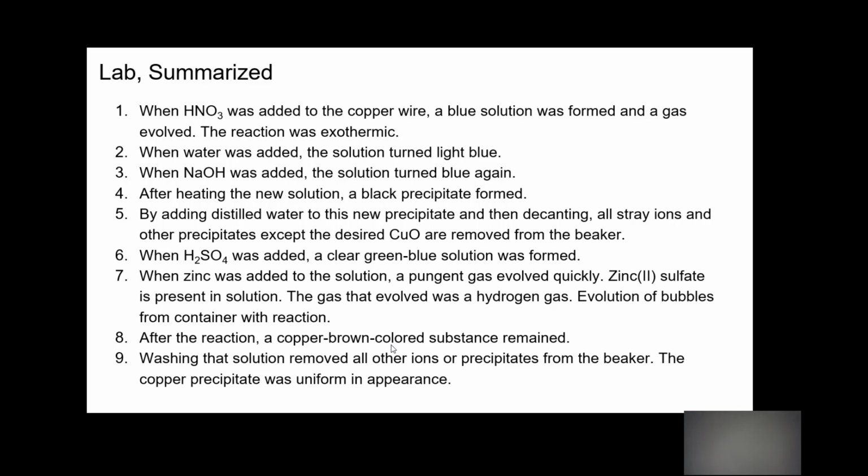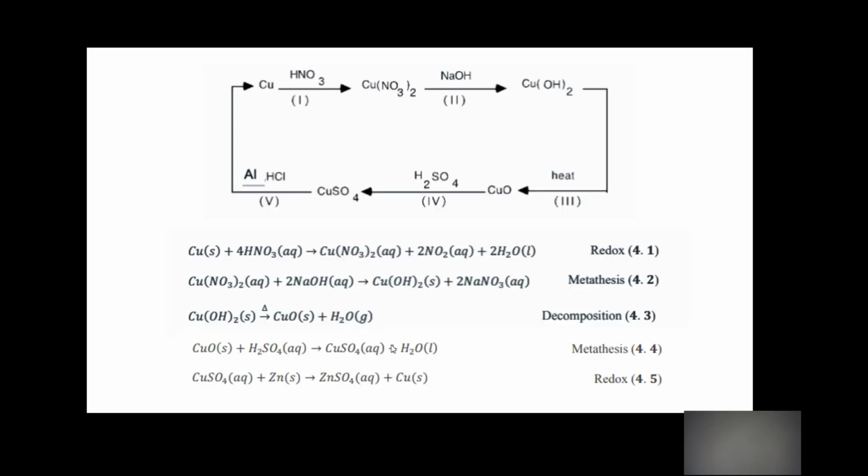I summarized it up. I did not create this. I found this off another lab that matches the copper one. I changed a few wordings that matched ours, and hopefully I matched it all up correctly. But this summarizes with colors and descriptions of what's happening, and that might make things a little better for you. Again, I copied it from somewhere else, so I believe I caught everything that didn't match ours, hopefully.